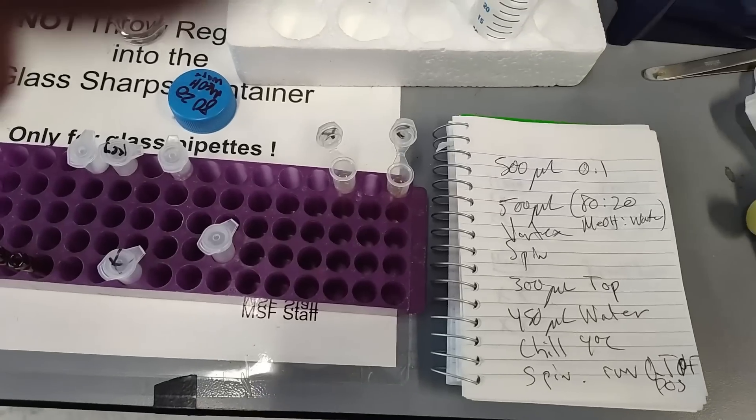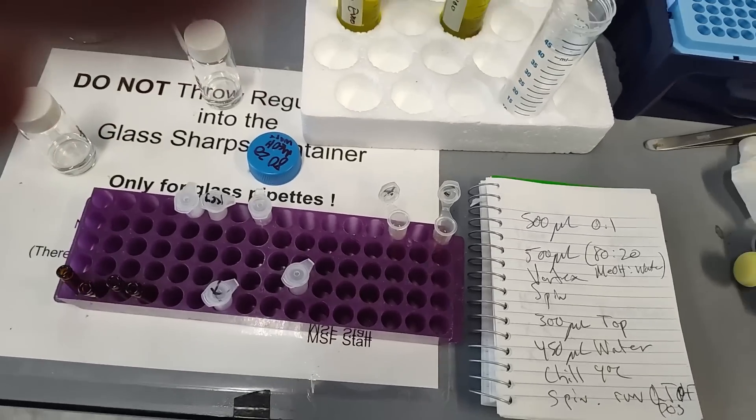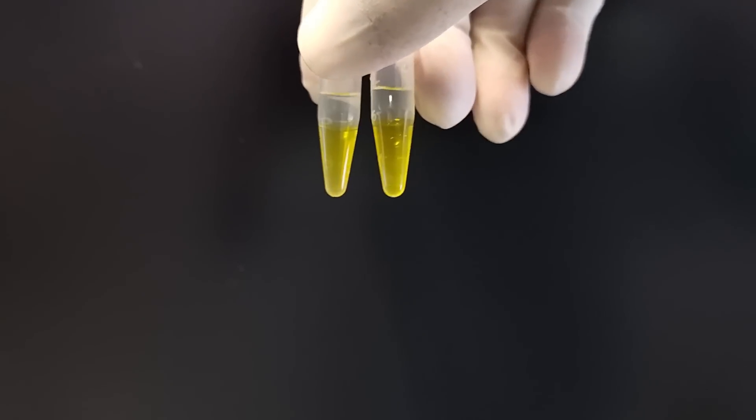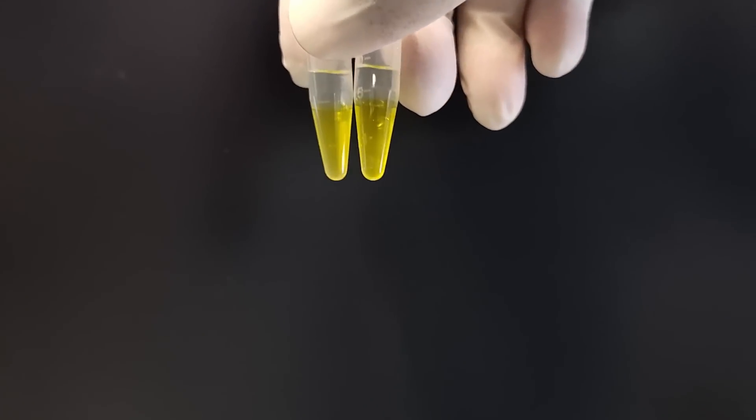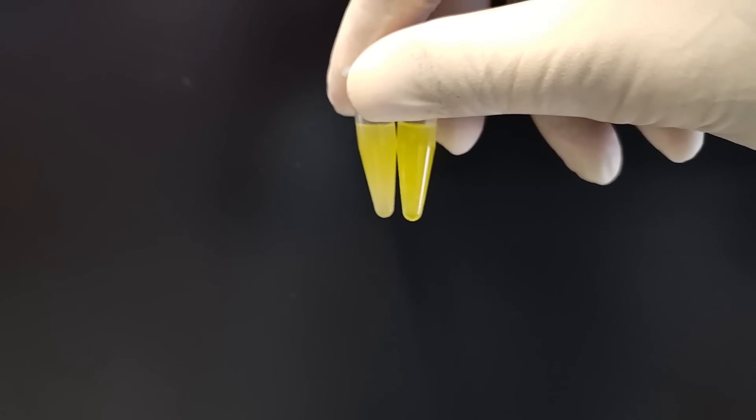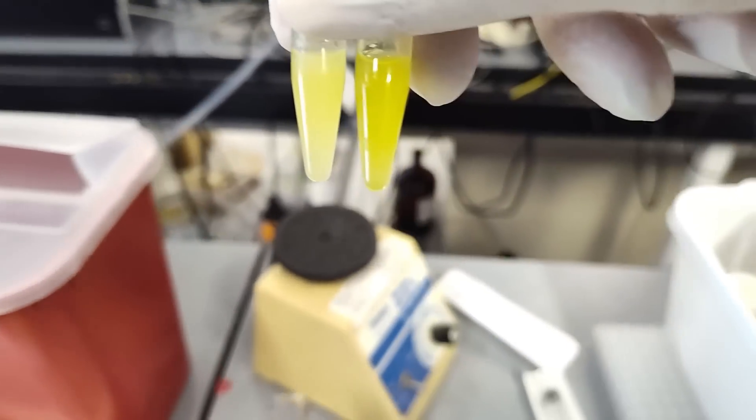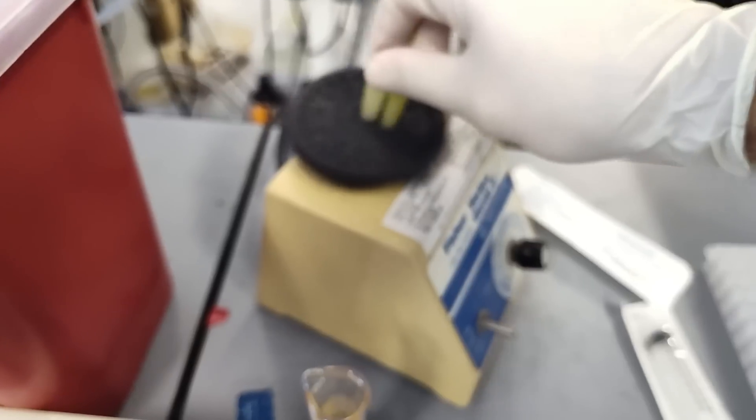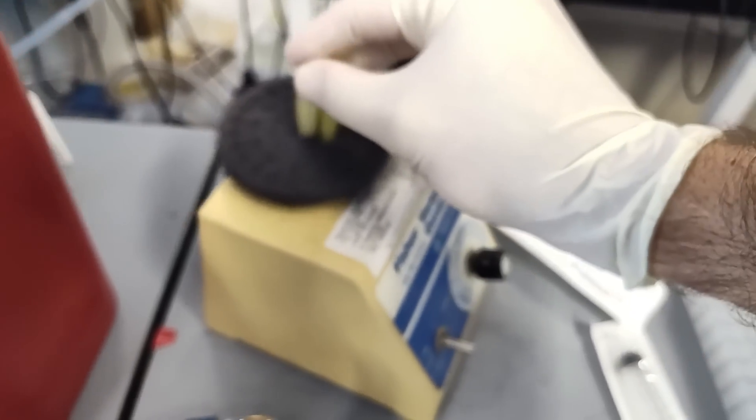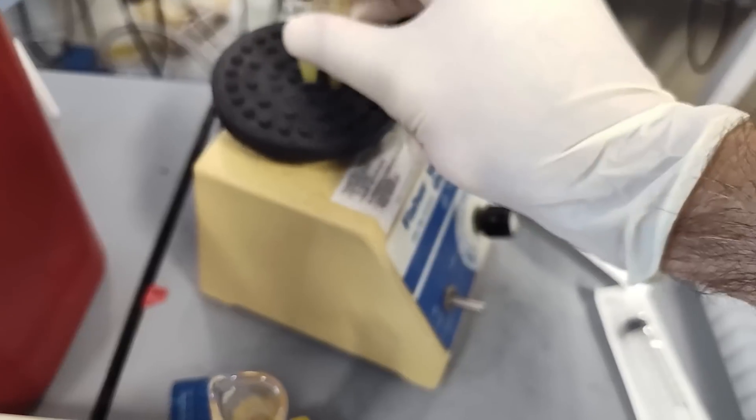And then we're going to vortex it and shake it up and spin it out. So there they are. I'm going to shake them out. Sometimes you can see differences just in the extraction process. So we'll shake these out. And then you're going to kind of already tell that there's a difference. Vortex them to be sure. Really get them mixed good.